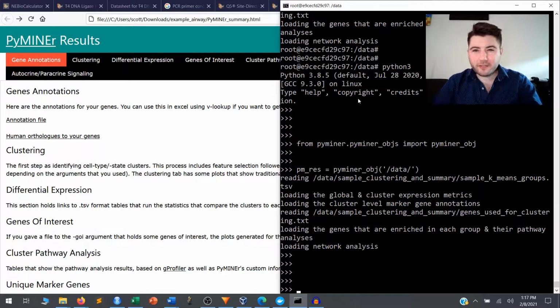So one of the annoying things about going through someone else's programmatic way of representing a large complex data structure is that oftentimes you have to flip back and forth between the documentation in one tab and the actual data structure that you're working with interactively.